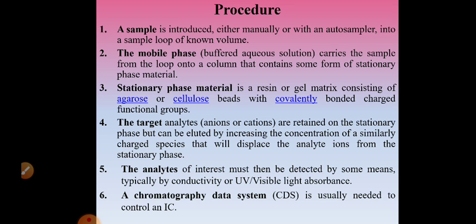By using acid and alkali, or alkali and acid, depending upon whether it is a cation or an anion exchange resin. Then removing the metallic impurities by chelating with EDTA. Removing the fines by decanting them, and finally treating the exchanger with chemicals like NaOH, HCl or NaNO3, depending upon what counter ions you want. So your ion exchange stationary phase is ready.